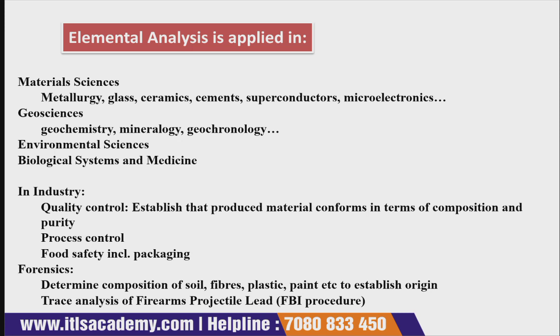So it has a huge application in pharmaceutical as well. For example, in quality control, QC: how the establishment confirms that the produced material conforms in terms of composition and purity. So this type of science can be used there. Then if you want to know the processing control, food safety, including packaging.